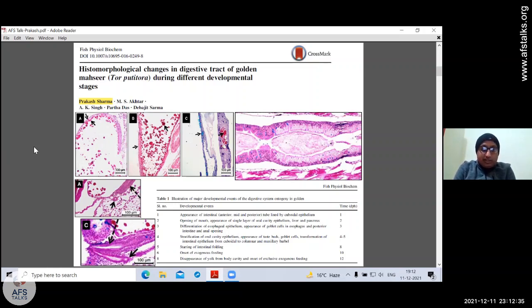Histology-based biomarkers, like protein absorption biomarkers in the intestine, lipid absorption biomarkers in the intestine, nutritional deposition and nutritional status biomarkers in the liver, zymogen granule formation, and the developmental pattern and dynamics of the zymogen granules in the pancreas.